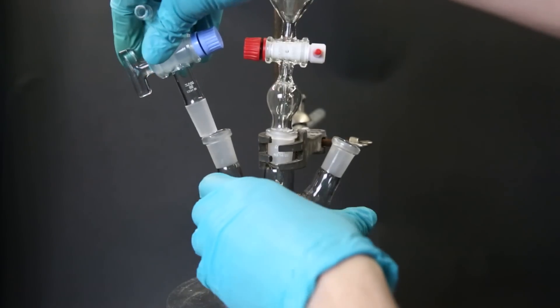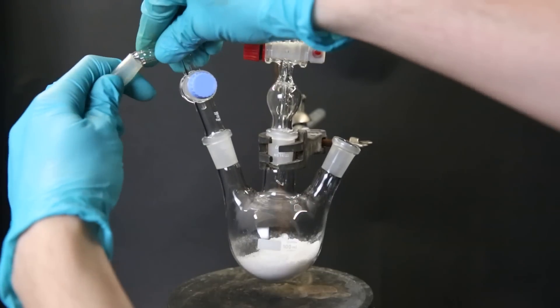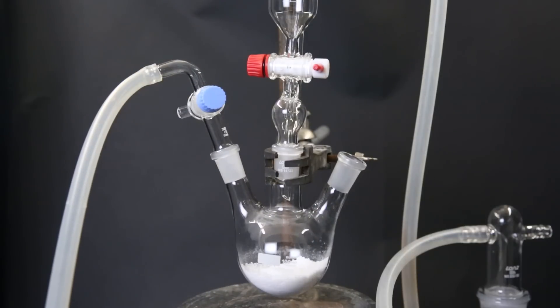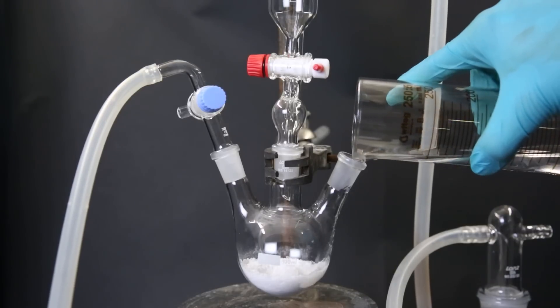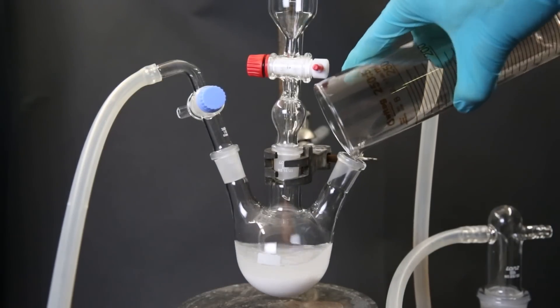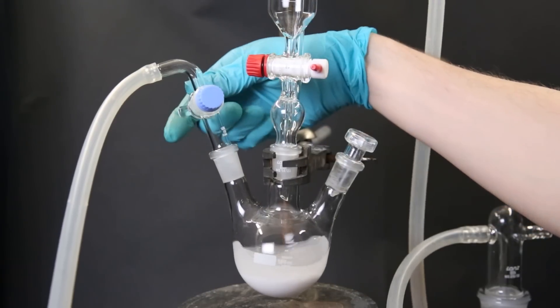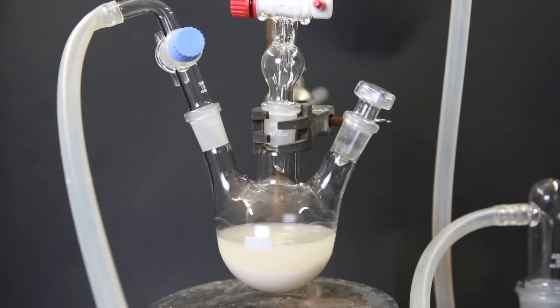I add a dropping funnel and a gas adapter, and then attach an argon line to the setup. On top of the dropping funnel, I add another gas adapter and connect it to a gas washing bottle, which will prevent any air from getting into the setup. Now I add 50 mls of THF to the flask. I then stopper the flask, which seals the setup completely, and I start the argon flow to purge out all of the air.